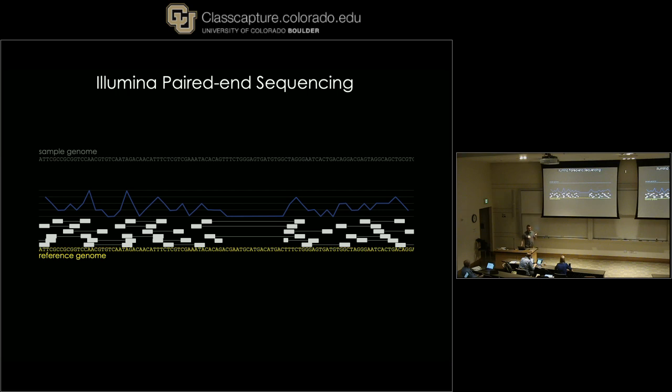We can also look at the characteristics of every pair. So we have a lot of pairs that look quite short, and then we have a few pairs that look quite long. We can actually characterize how unexpected the length of an individual fragment is if we go back and look at that expected size distribution of our fragments. So some of them are exactly what we expect, and some of them are much larger than we expect. We also have these sequences where the actual sequenced end is not continuously aligned.